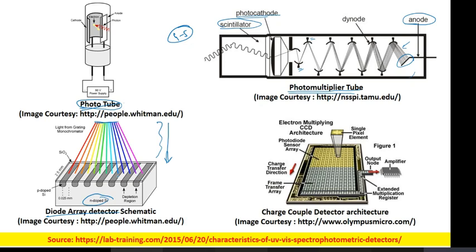So this array of detectors helps you to get the information in a spatial domain. From here to here we are in the spatial domain, but when the photons of different wavelengths are striking, we are basically converting this distance information into wavelength information. For a particular source, the wavelength component should be known, and you can convert this distance to the wavelength. You can correlate it. So from there you can get the wavelength versus intensity plot.